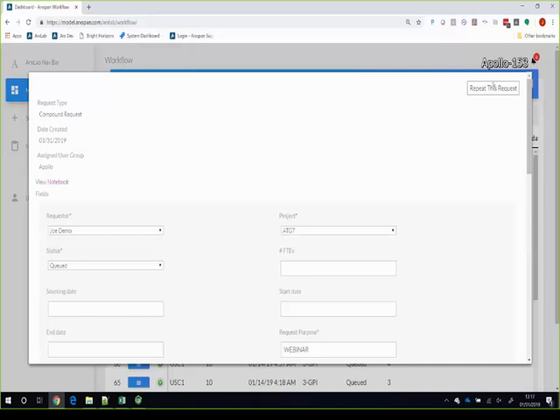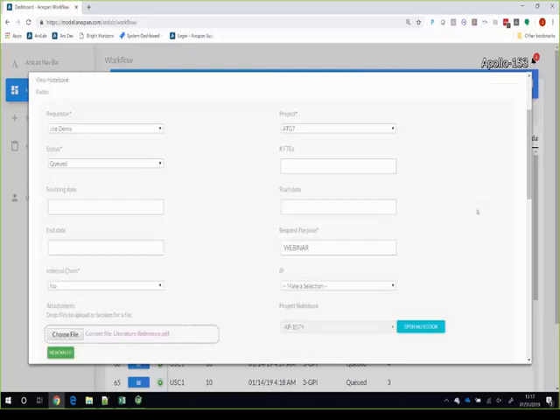There's a couple of things that you can do once a request has been created, and I think one of the more relevant ones is actually repeating the request. So generally speaking, this will allow you to repeat a request so that you can get most of those compounds resynthesized. You can take some out, change the purity, do whatever, but it sort of simplifies the data entry. It also creates a link back to the request from which you made the copy so that you can see the chain of events a little bit more easily.